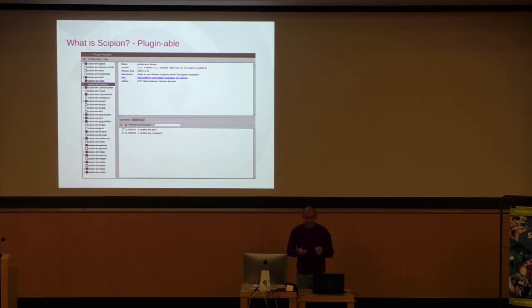The other good thing is, this is just a screenshot from yesterday on my laptop. Those in bold, this is how we decided to highlight them, are modeling plugins that have been updated, maybe last week. So you can easily click there, like I did here for CryoSPARC, then run, and then you update and have those plugins updated.